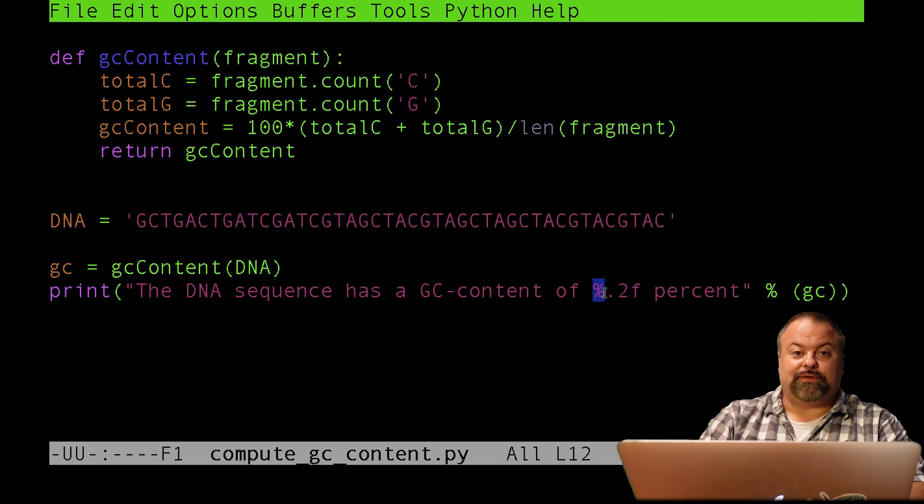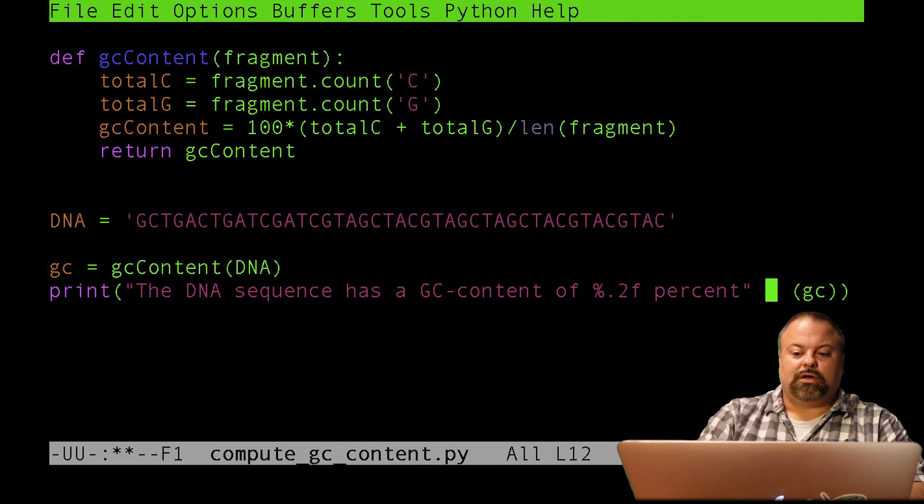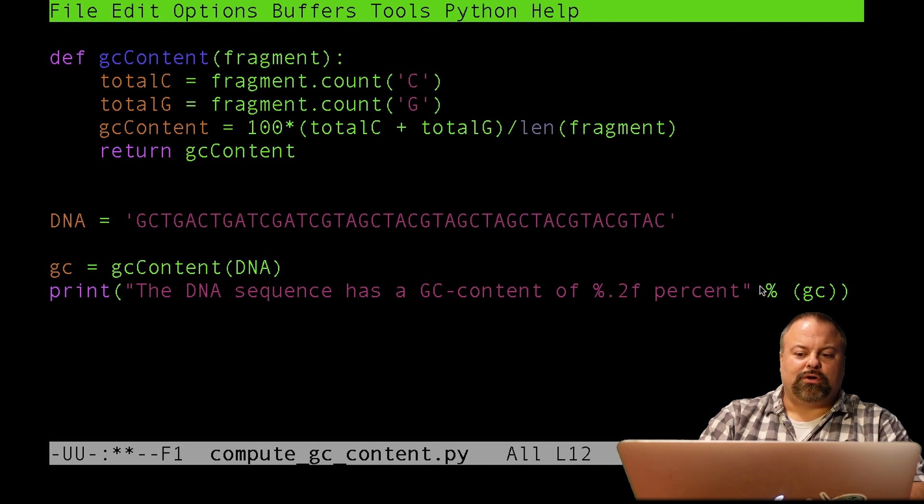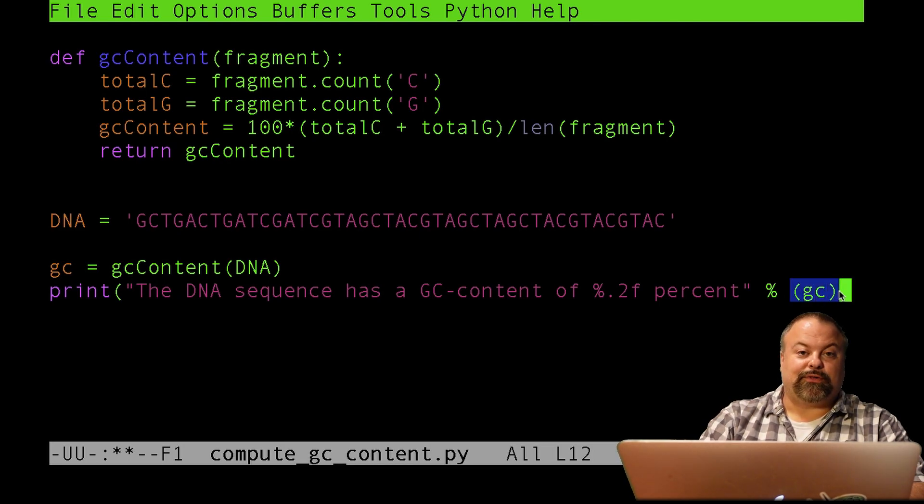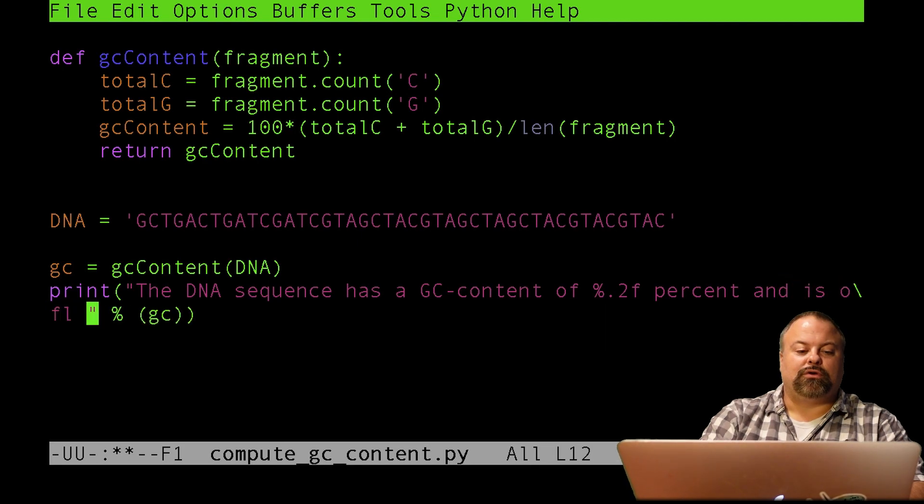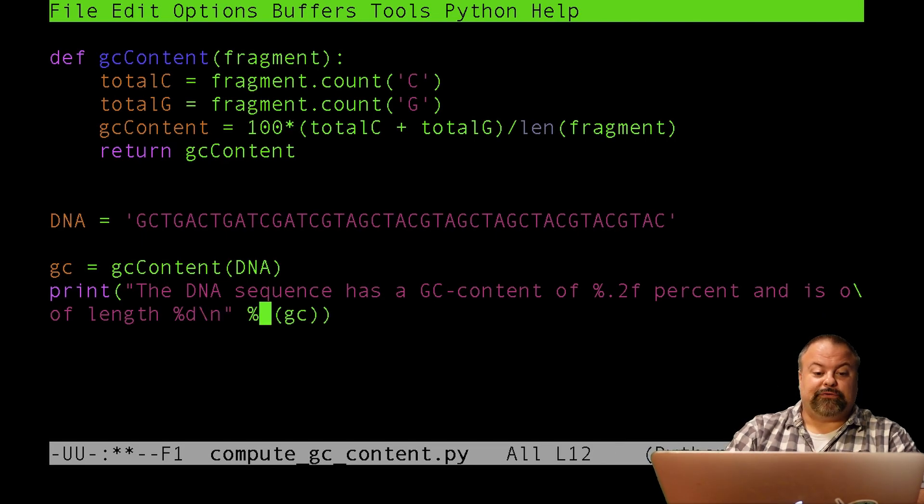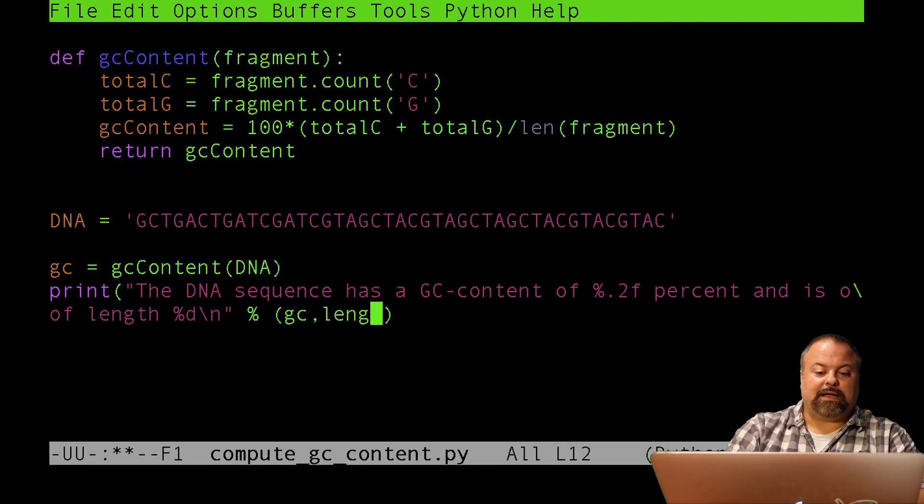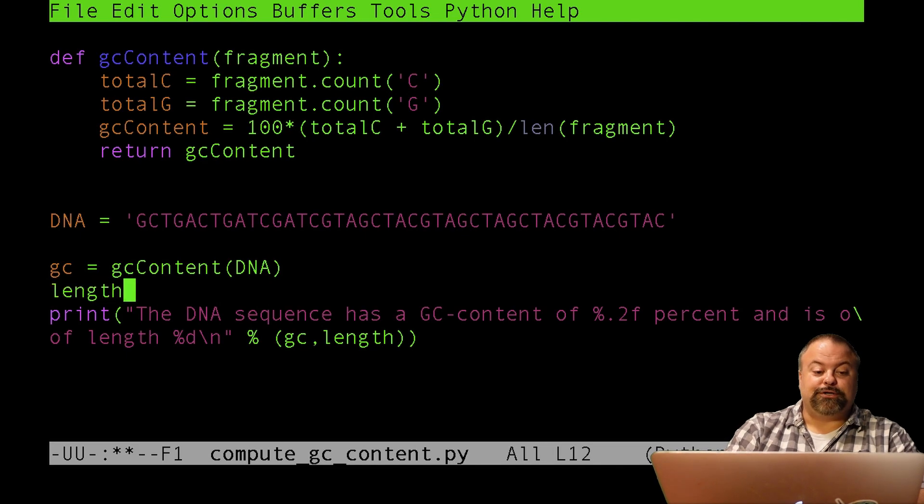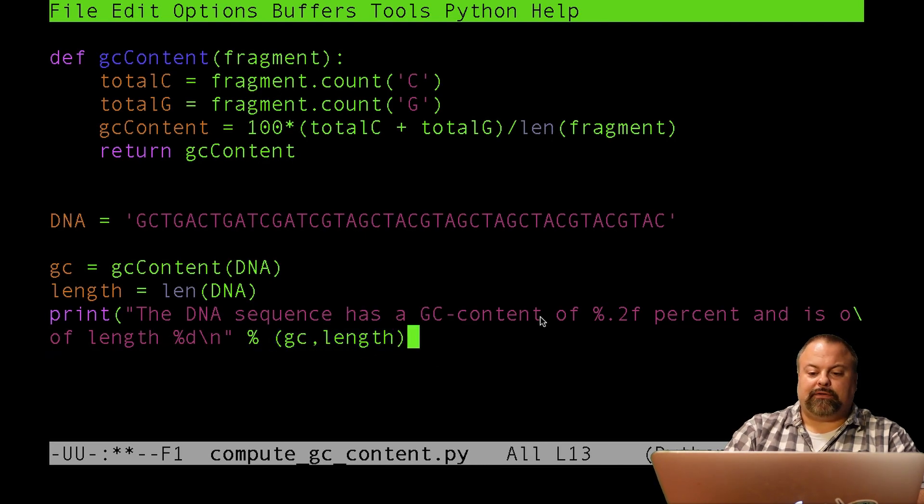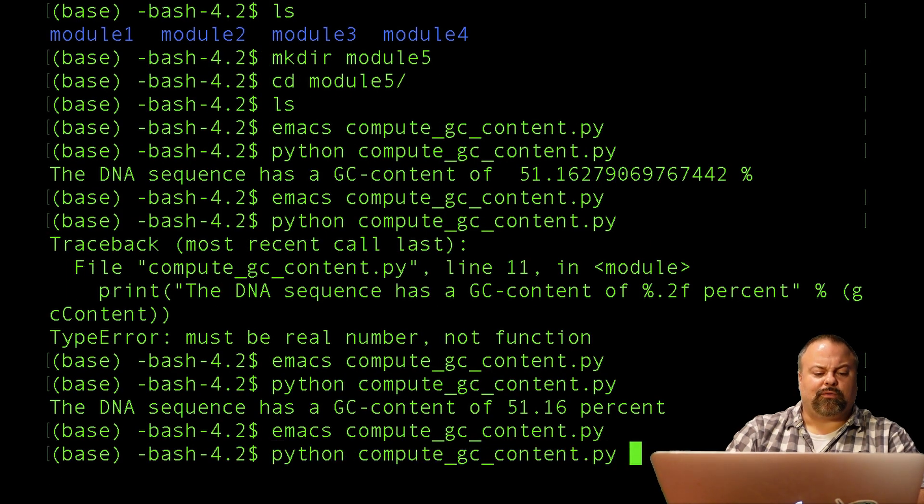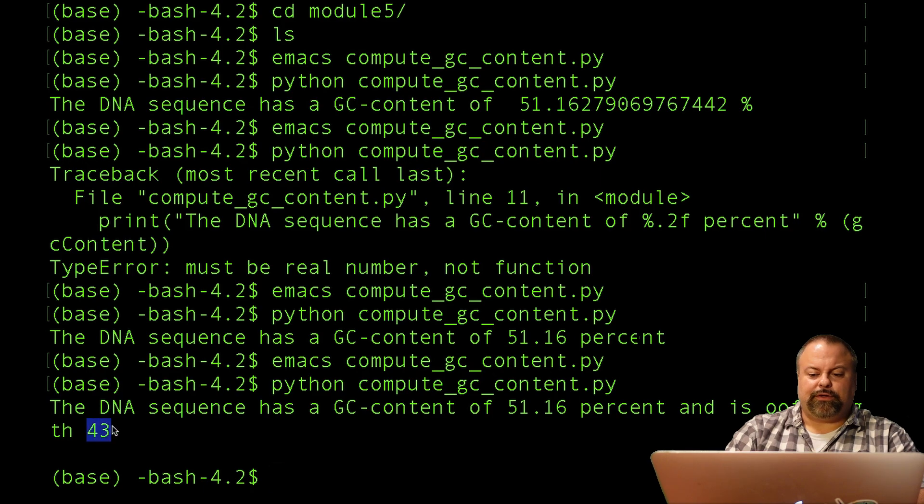So I could put something like here, I could say, and is of length, and then put another placeholder, in this case, percent D for digit. And so to take care of that, I'll put another variable called length here, as opposed to the function len. So now I have a tuple defined with two entries, GC, which is a float, and length, which is an int. And the percent 0.2 F is indicating the float, and the percent D is indicating the int. So D for digits, and so I'll save that, and I'll try to run this. And there it is, and is of length 43.